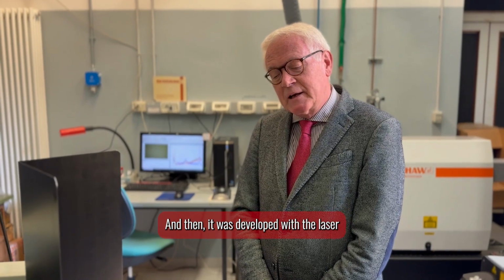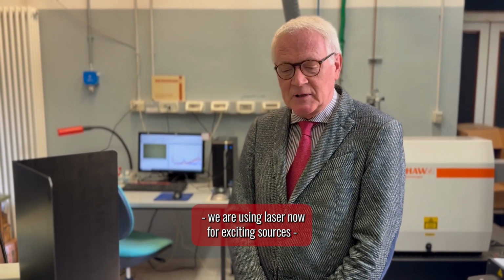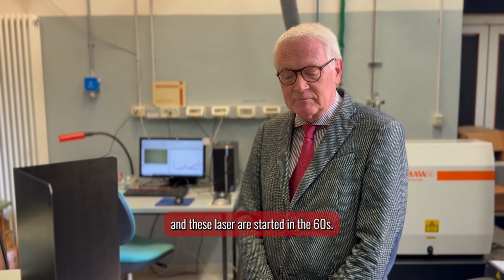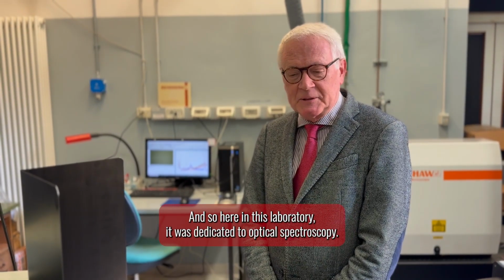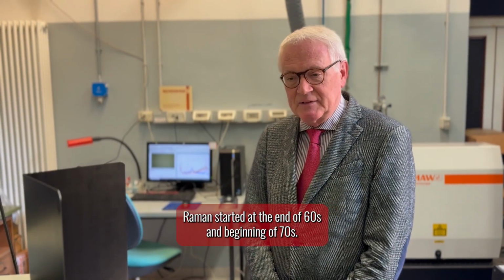And then it was developed with the laser. We are using lasers now as exciting sources. And these lasers started in the 60s. And so here in this laboratory, it was dedicated to optical spectroscopy. Raman started at the end of the 60s and the beginning of the 70s.